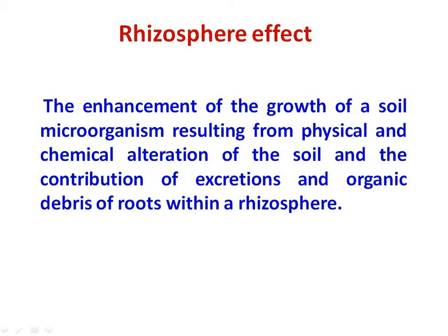However, this influence can be measured simply by plating technique and expressed as rhizosphere effect, that is a stimulation that can be measured on quantitative basis by the use of rhizosphere to soil ratio, obtained by dividing the number of microorganisms in the rhizosphere soil by the number of microorganisms in the non-rhizosphere soil. The R/S ratio, that is rhizosphere to non-rhizosphere ratio, varies with different growth stages.